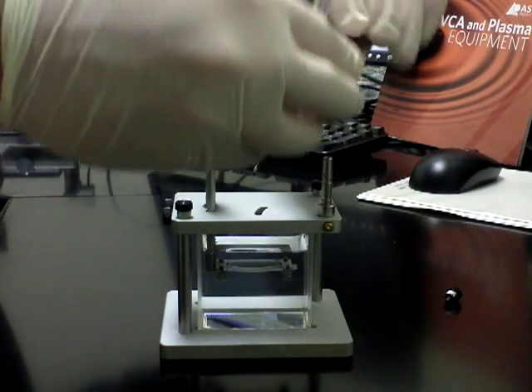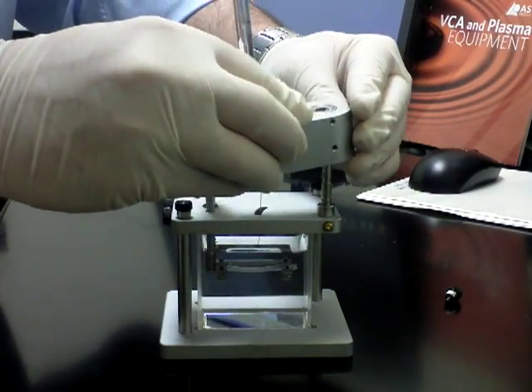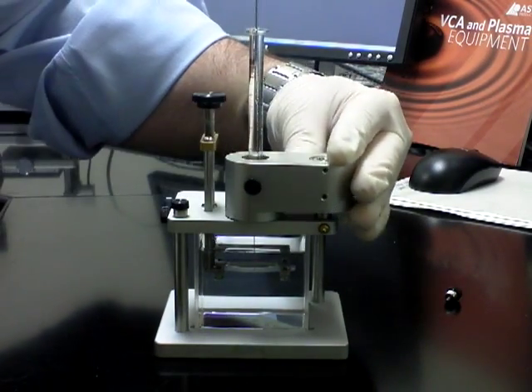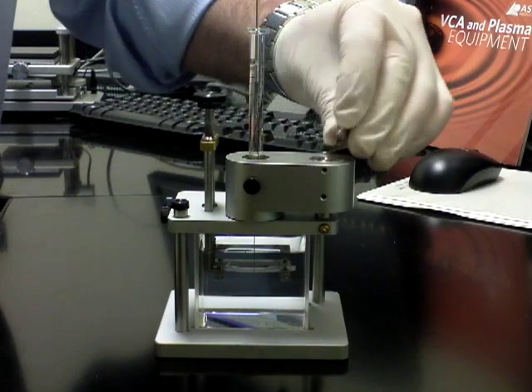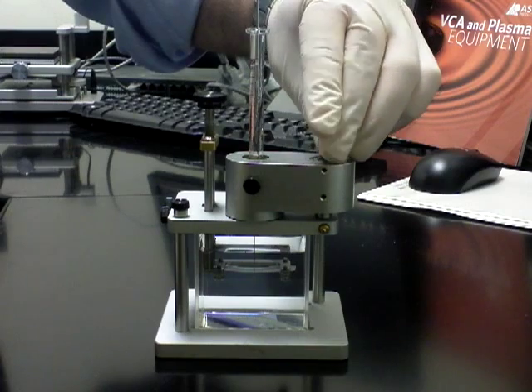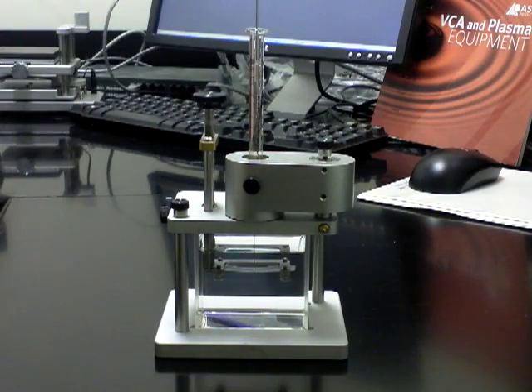Put the syringe holder back in place, put the one screw back on top, and then take the captive bubble accessory and place it on top of the VCA stage.